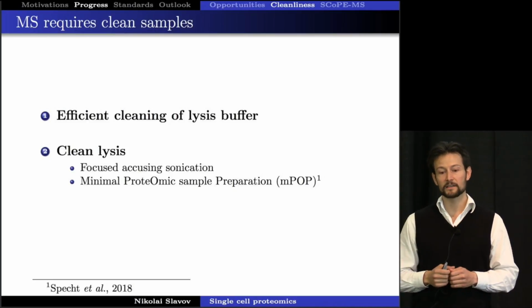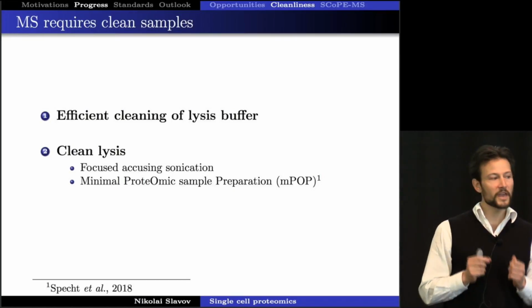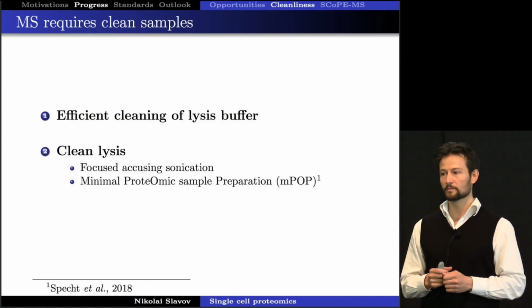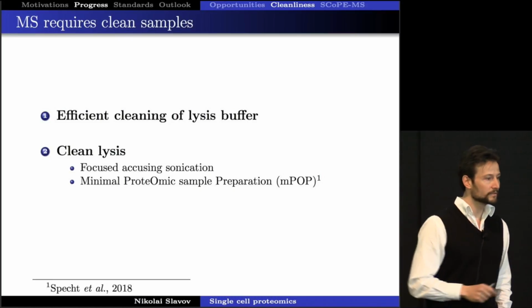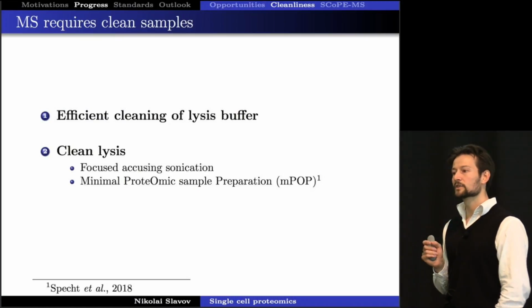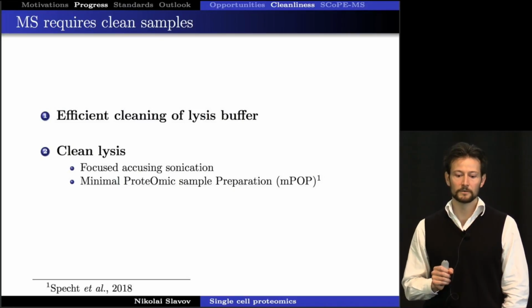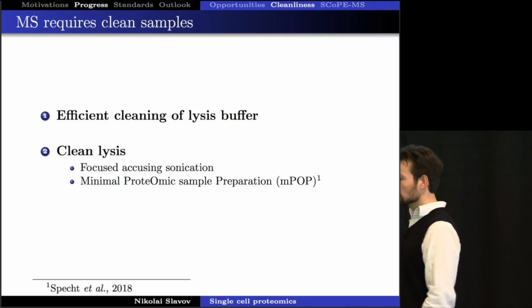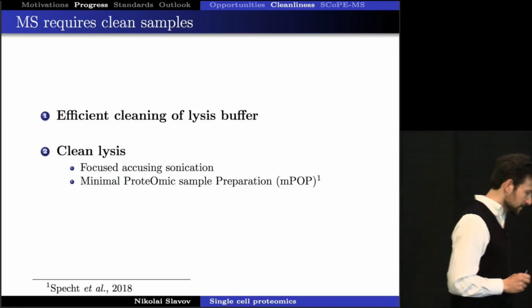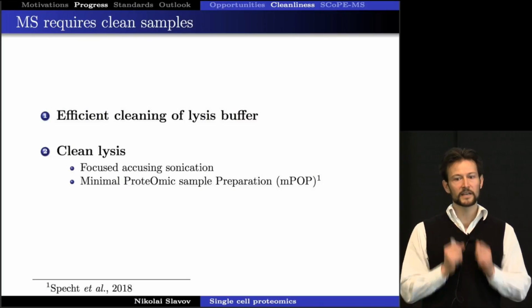And I confess, timidity. I didn't know how to do that. I wasn't brave enough. So I tried to do the opposite. I tried to focus on being able to prepare samples that don't need to be cleaned up. And one way that existed, that Alexander Ivanov, among others, have used previously, to lyse cells without using chemicals is to hit them with a lot of vibrations, to use focused acoustic sonication. There is an exorbitantly expensive machine, I don't want to tell you how much it costs, that can focus energy into a small glass tube and lyse cells in pure water.